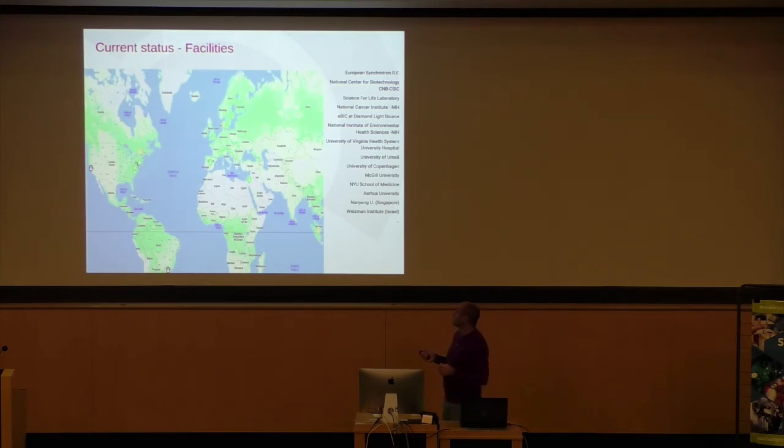In green, you can see those that are running Scipion every day as the online processing software for the facility. In yellow, you will see some that have probably started using Scipion, but maybe not every day. And some of them, in case this is Stanford, this is someplace in Brazil, they expressed interest, but maybe just that.